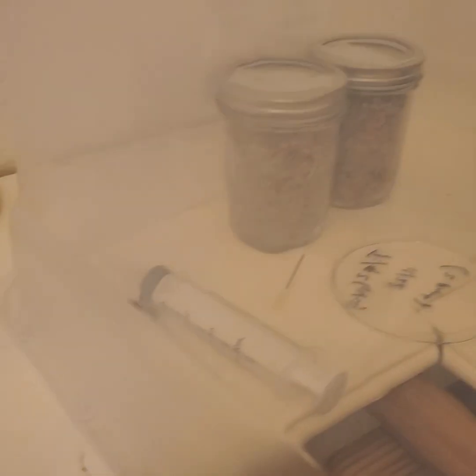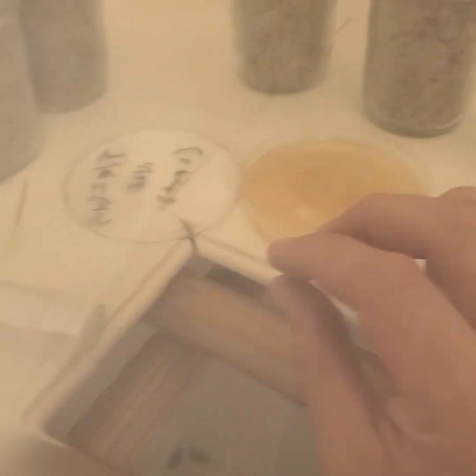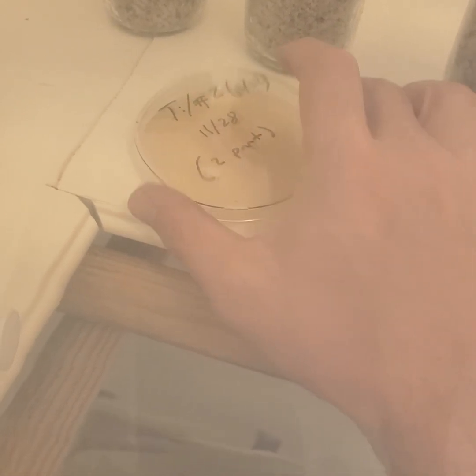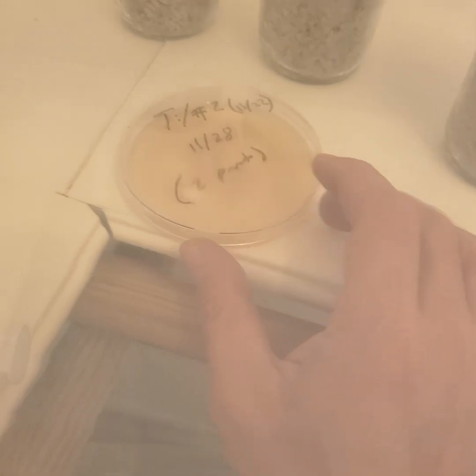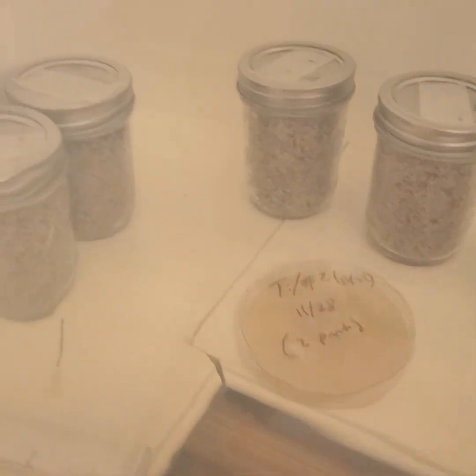Hopefully things go well. I don't know what to do with this dish — I might go throw it out in the yard and see if I can grow some with mother nature. These five jars I've seeded, or inoculated.